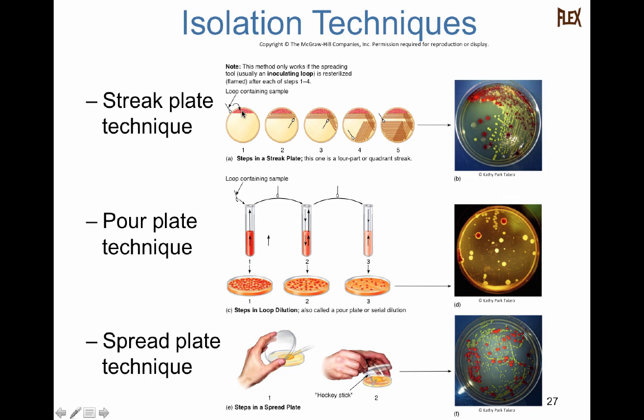Okay, now I would suggest, even for the online group, when you guys are inoculating your plates, you can try to do this streak plate technique if you realize that you have an agar plate that ends up growing a ton of bacteria. You could take a sample from that plate and then place some on a new plate on one side of the plate, okay?